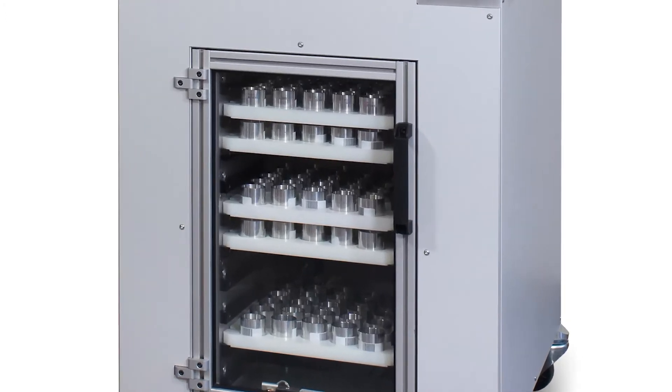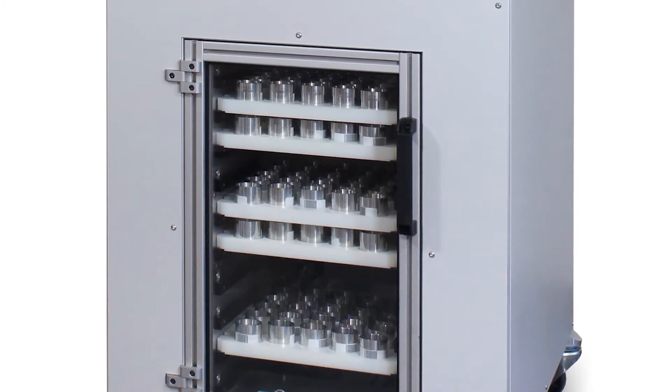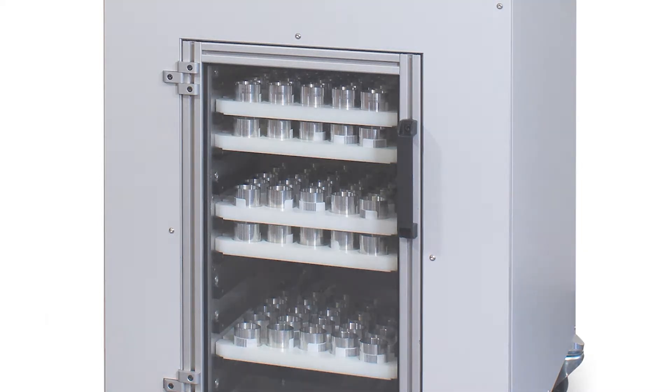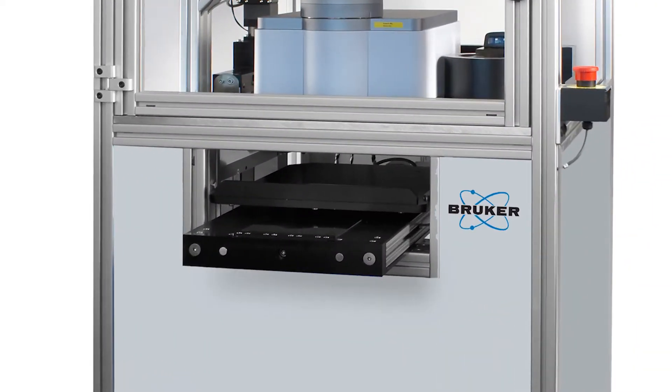The basic version has manual loading of the sample trays in the 10 tray positions. Tray loading for the basic version is performed by opening an interlocked door to access the internal storage area with 10 tray capacity.